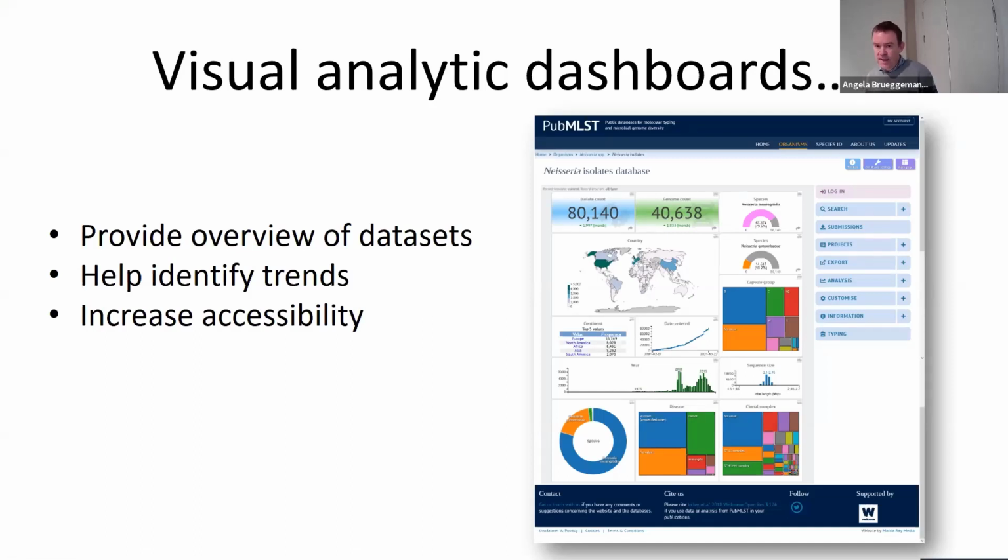submitted to the database. The whole dashboard is completely customizable, so you can go in and add fields that you want. But it also gives you a way of educating users as to how they can construct queries, because for elements that break down an individual field value, there is a link that takes you directly to the data set for that value and actually creates the data query. So a user can click that link, and it will show you how you would query the database to search for Neisseria meningitidis, for example.